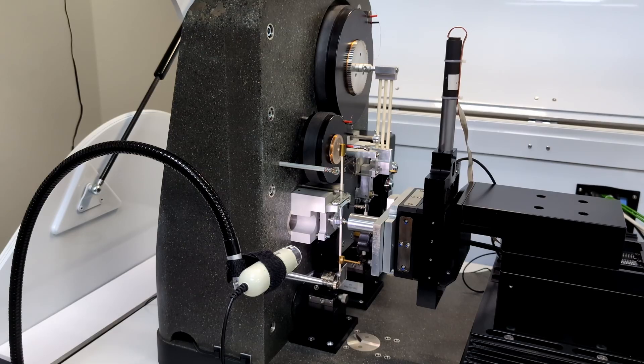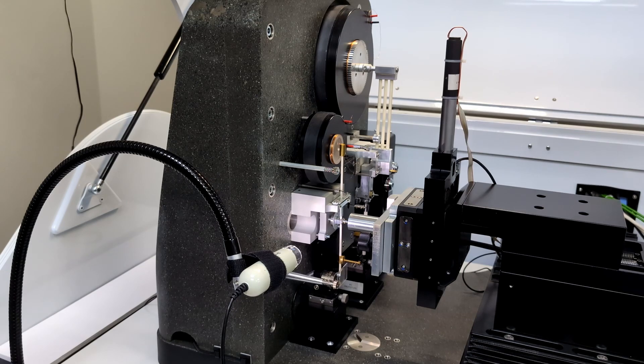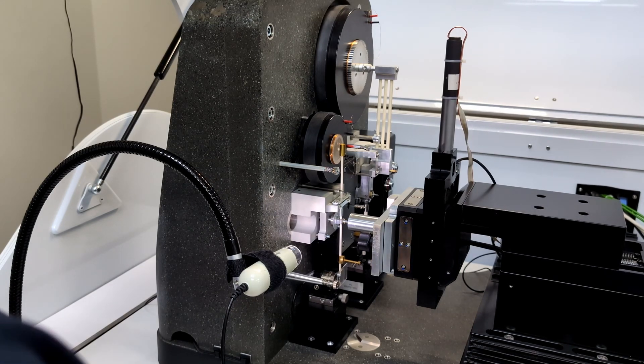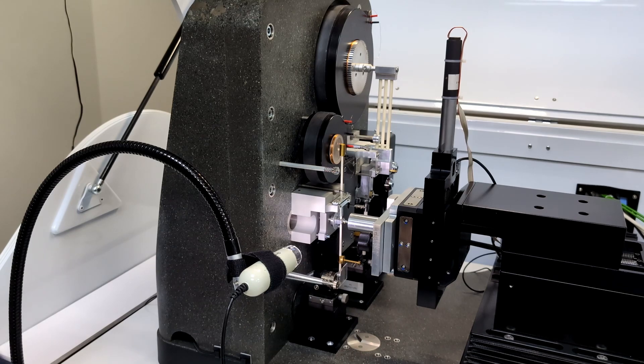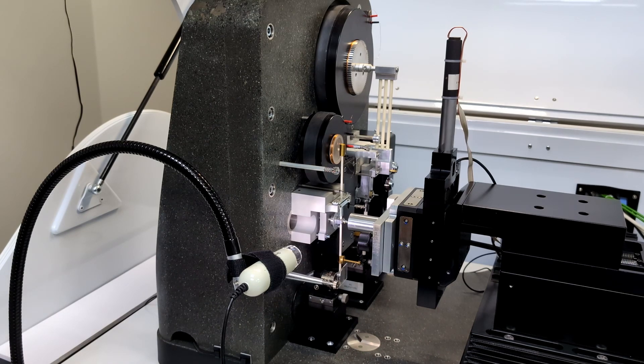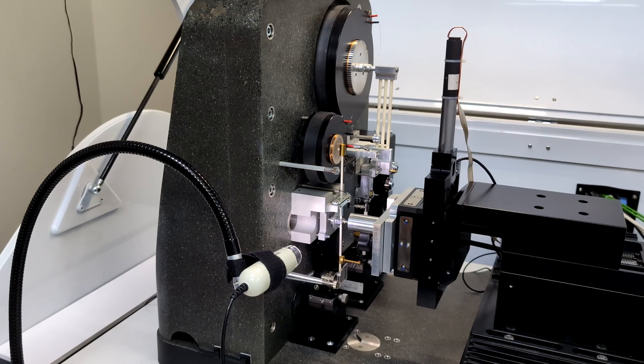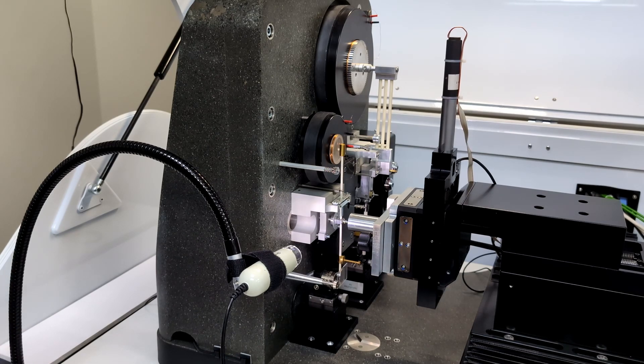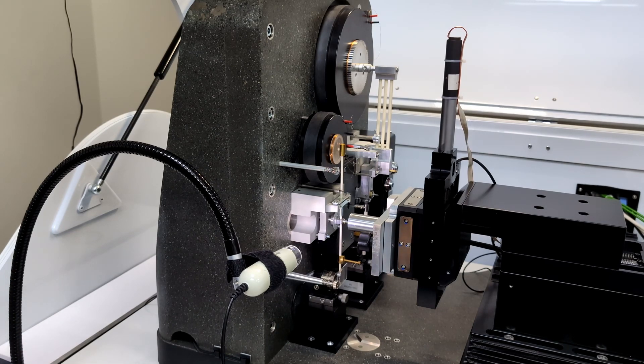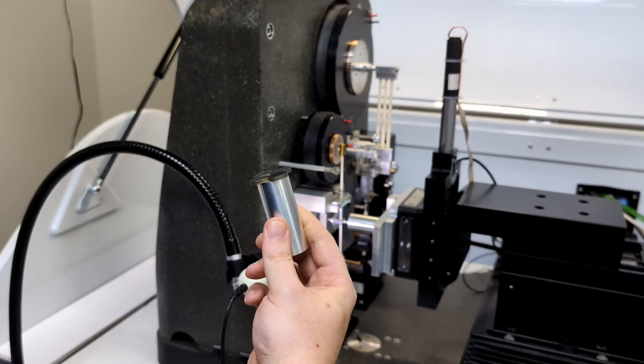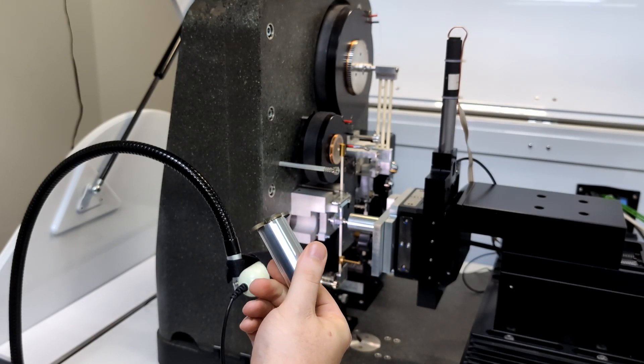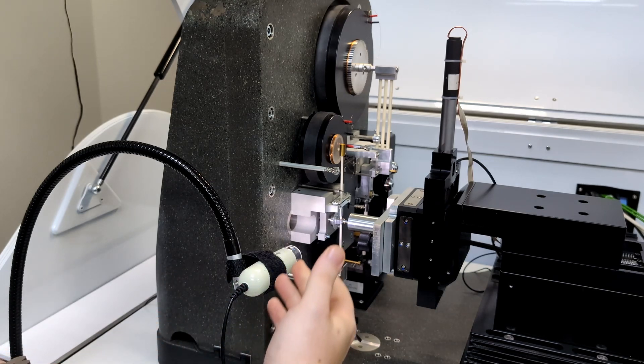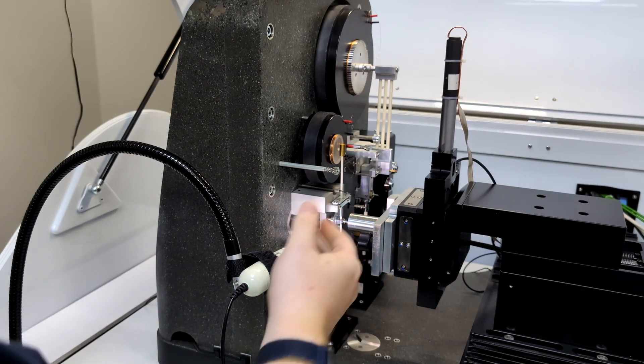The initial setup of an impact test is quite similar to an indentation test in terms of sample mounting. First, we set up the electromagnet, here at the bottom, to be the correct distance away from the load head in order to achieve a consistent acceleration distance, and therefore impact energy for each test. Now we can install the sample using the standard sample stub. Here, we can see multiple samples installed. As I said earlier, you can test multiple samples at once.